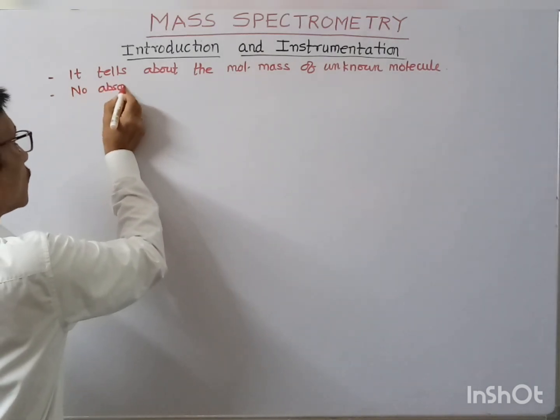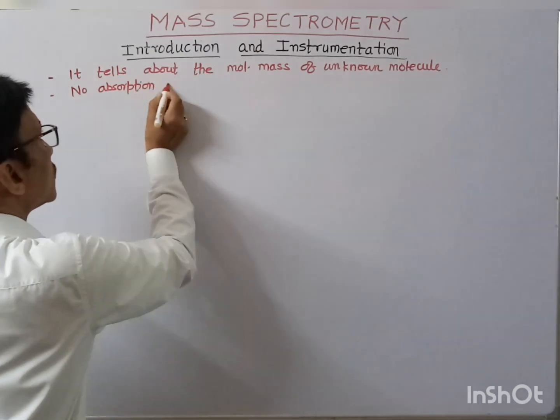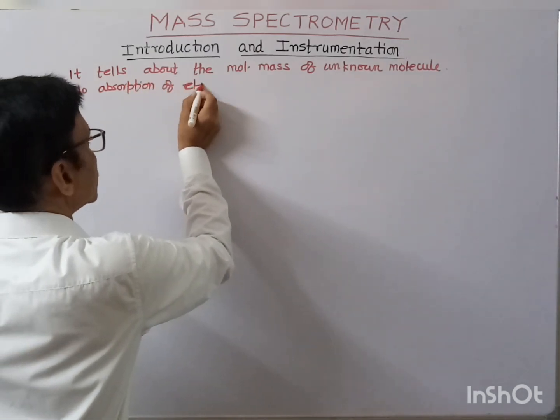No absorption of electromagnetic radiation.